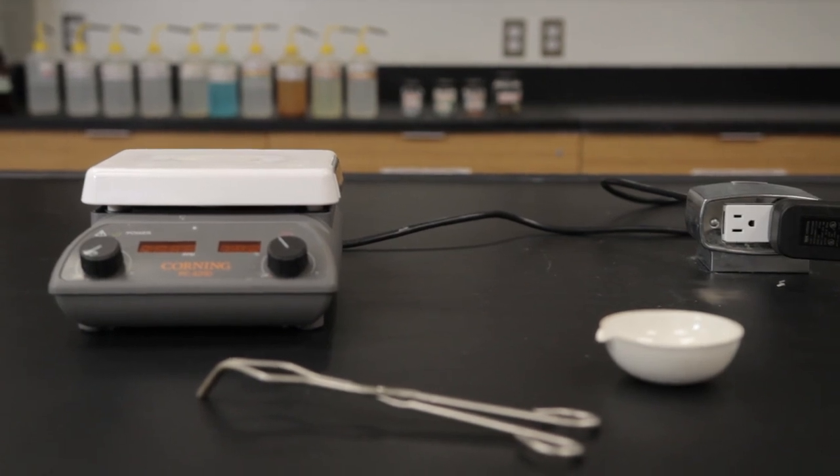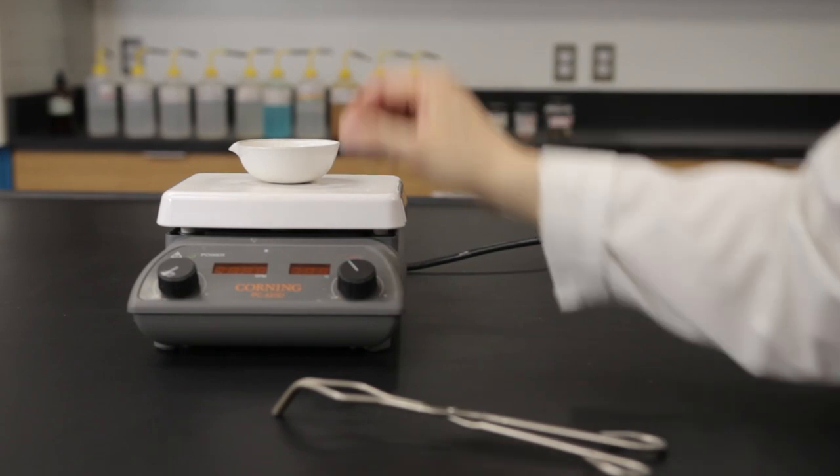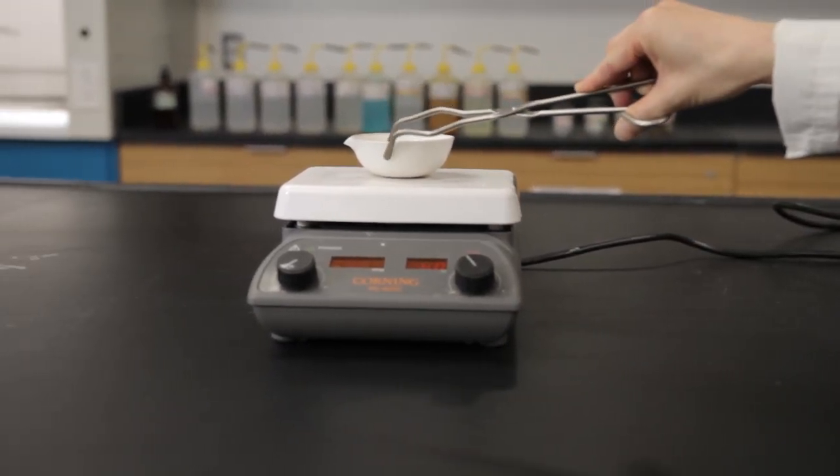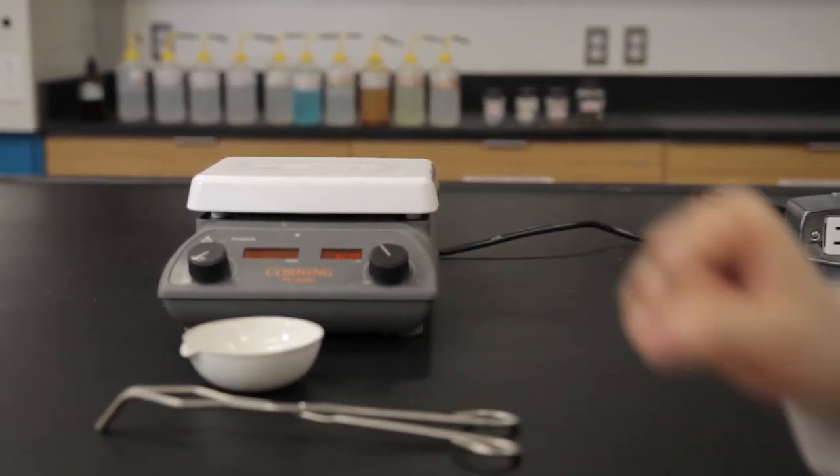Wash an evaporating dish with soap and water. Rinse it with distilled water and dry it. Heat the evaporating dish on high heat on a hot plate for five to ten minutes to remove any trace of moisture. Remove the dish using crucible tongs and allow it to cool to room temperature.